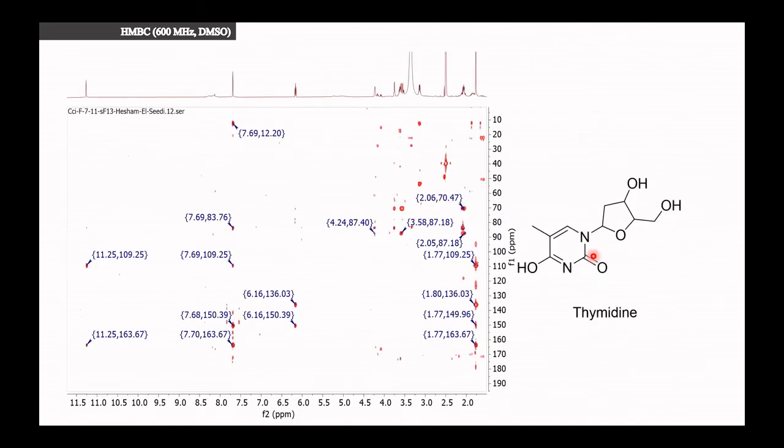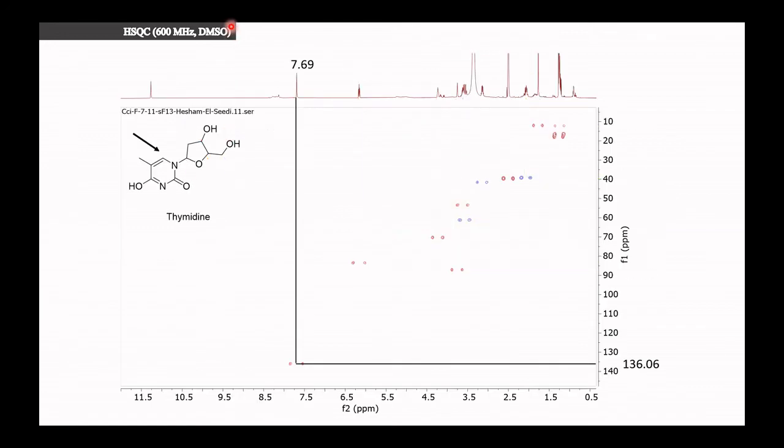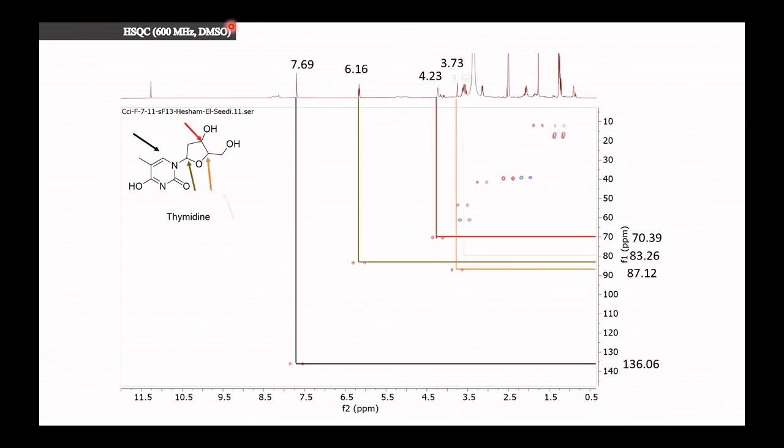Now, if you take another example about this, now you can see it is many spots. Why many spots of the same proton? If you look here, one spot, spot, spot, spot, spot. In this range, it is proton. This range is carbon 13. So it is the same like before, but you have one factor extra, which is extra dots. In the previous one, every peak has only one spot. But this is different spots.